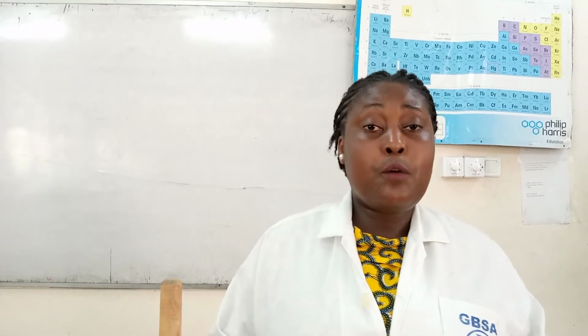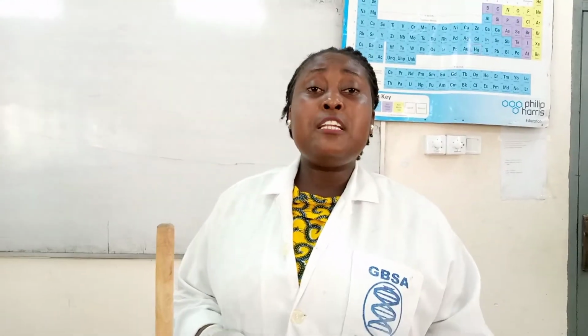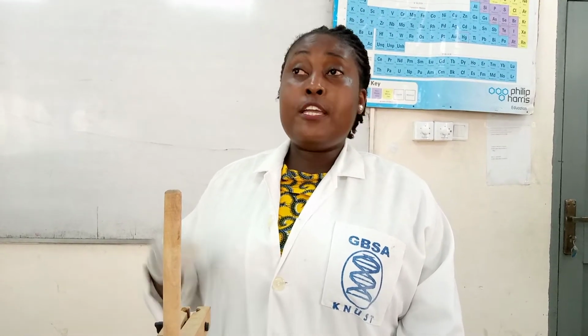So now that I have this range here, what I can do is take a phone. Now when you go home, you take a phone and try to Google to find out some of the compounds that have a melting range between 121 degrees Celsius to 122. If you get that information online, then you can confirm the compound based on the melting range.